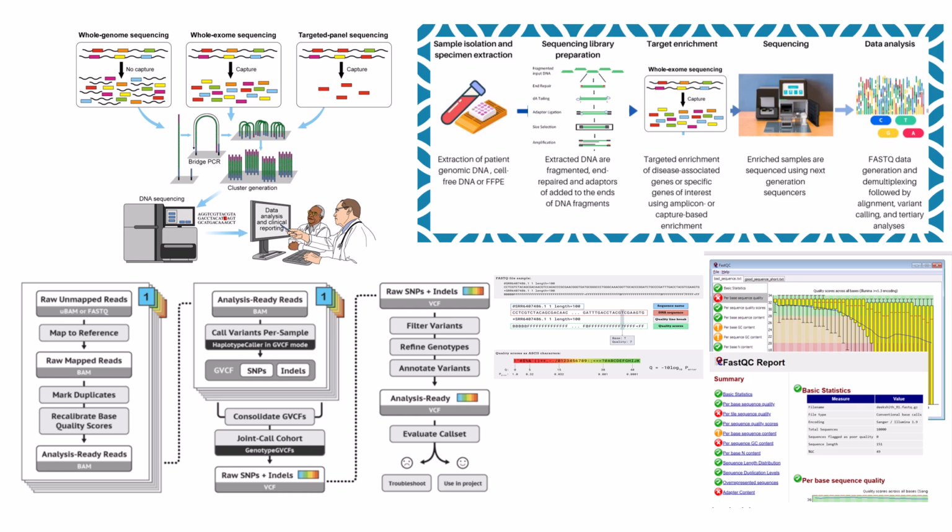Exactly. Then comes a really practical but important step: final organization. All the key output files, the recalibrated BAM file, the aligned reads, maybe the GVCF, and most critically, that final annotated VCF file with the filtered, interpreted variants need to be moved into designated permanent storage folders. Got to keep things tidy and findable. Absolutely. For clinical use and long-term archiving, the script often uses commands like mv to move files, and sometimes ln -s to create symbolic links, which are like shortcuts, so files can appear in multiple places without being duplicated. Smart. Saves space.